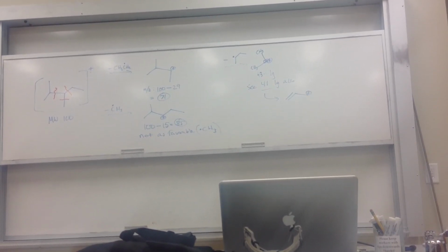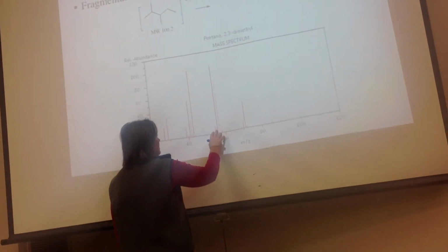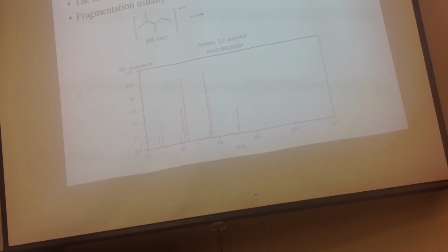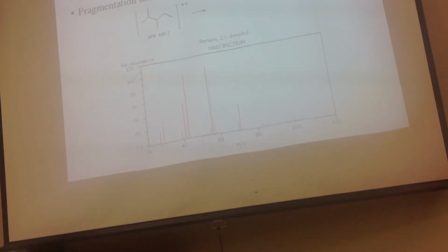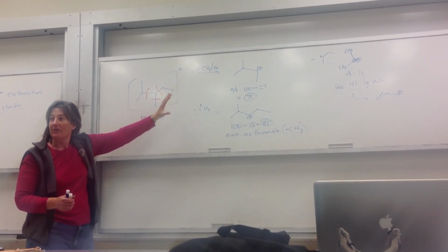We haven't tackled this. We haven't tackled this stuff right below 60. Right? There's obviously something important going on there. What do you think that is? It's the other half, exactly. When I wrote it in between the isopropyl and that large chunk, I chose to take the large chunk off as a radical. It could have gone the other way too, right?